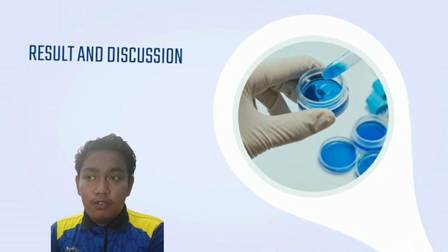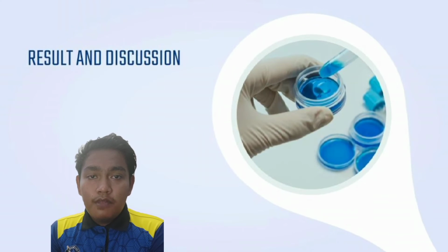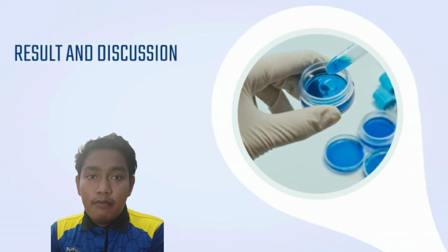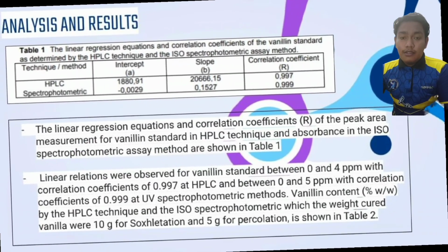Today I'm going to continue this presentation with the results and discussions about the determination of vanillin in vanilla essential oil by high-performance liquid chromatography. Now we move to the results and discussions.